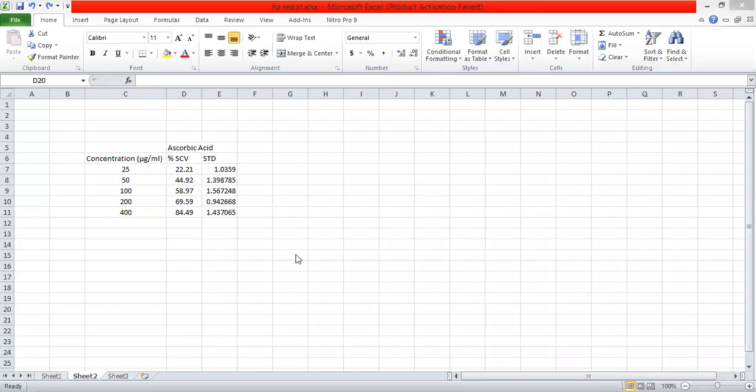Hello everyone. Today we are going to learn how we can find out the IC50 value — that means inhibitory concentration where 50% inhibition occurs — calculated from the visual inspection of an Excel graph.